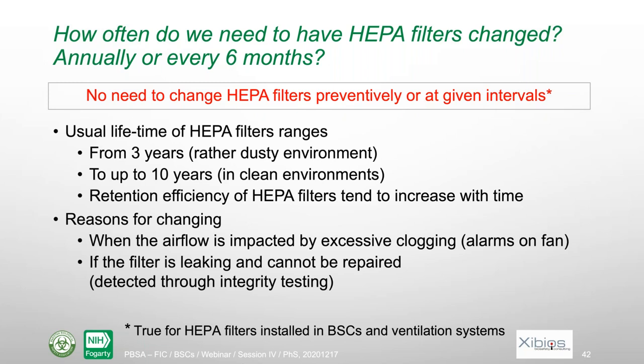There are actually two reasons for changing HEPA filters. First, when the airflow is impacted by excessive clogging, that means if there are too many particles in the filter so that it slows down the airflow, and you will notice that because of the alarm. There are some alarms on the fan that measure the pressure before and after the fan. So in that case, you will have an alarm on your biosafety cabinet and you know that you have to replace the filter.